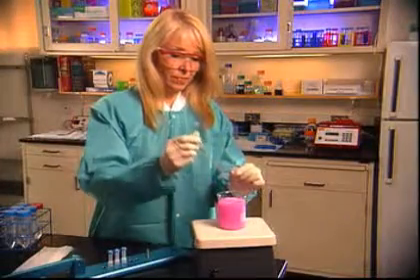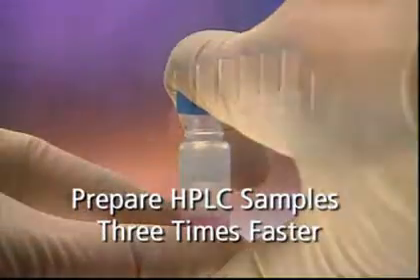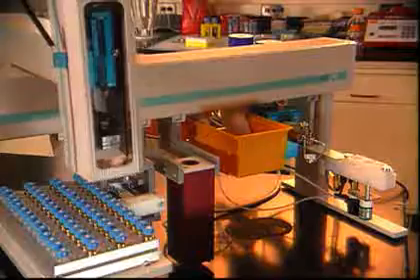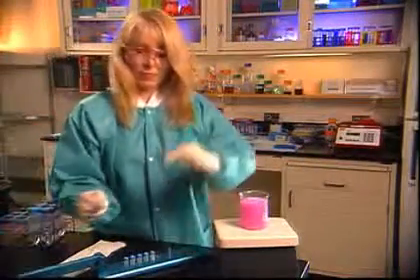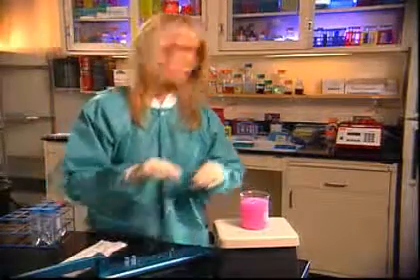The Whatman Mini-UniPrep syringeless filter provides the fastest, easiest method for HPLC sample preparation. Fully compatible with automated systems, Mini-UniPrep streamlines processes, greatly enhances lab productivity, and lowers costs.